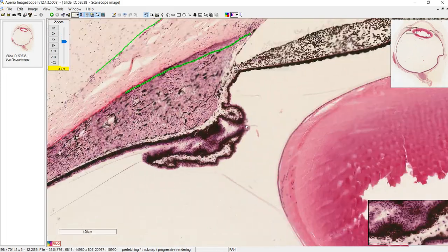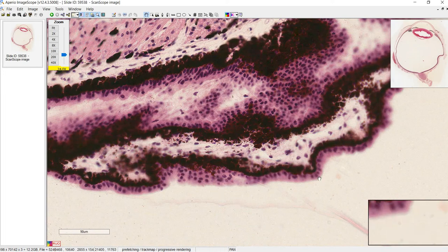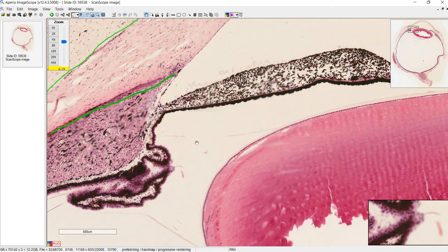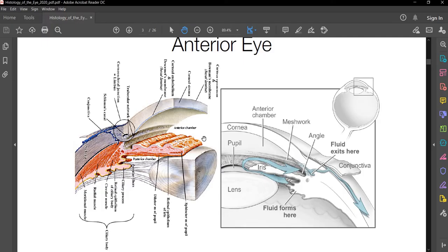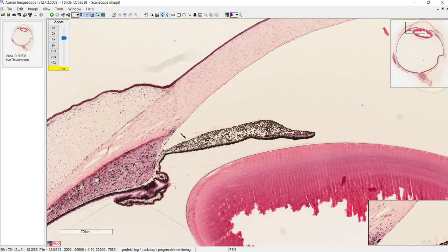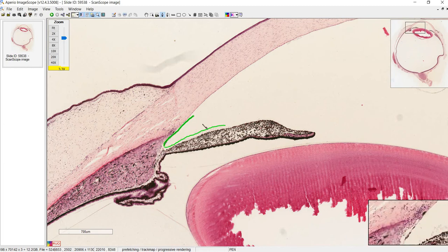Over here we have the pars placata, an epithelium connected to the ciliary body that produces aqueous humor. The aqueous humor flows through the posterior chamber, around the iris, and into the anterior chamber. It then flows into the intersection between the iris, cornea, and sclera — that's where you have the trabecular meshwork, a bunch of little holes the aqueous humor drains through before going into Schlemm's canal. That area is the iridocorneal angle — which is exactly the angle referred to in open-angle and closed-angle glaucoma.